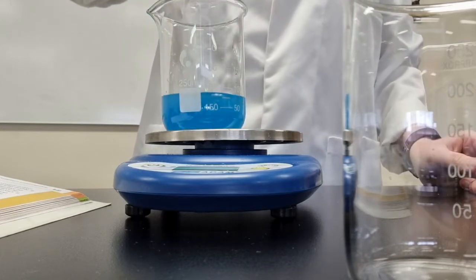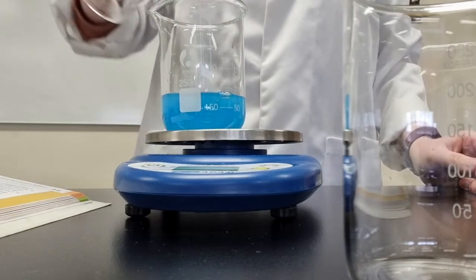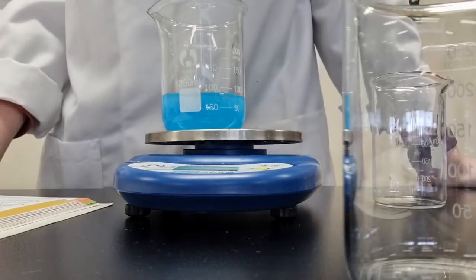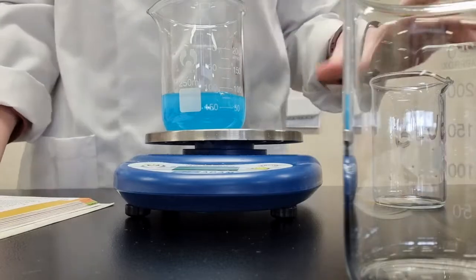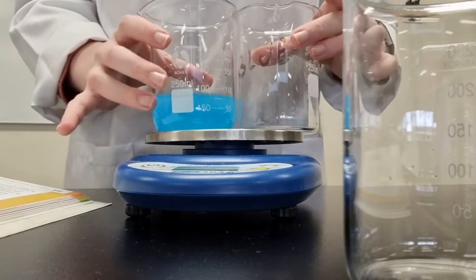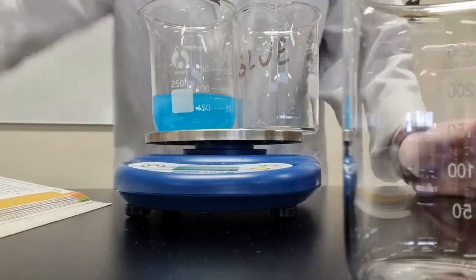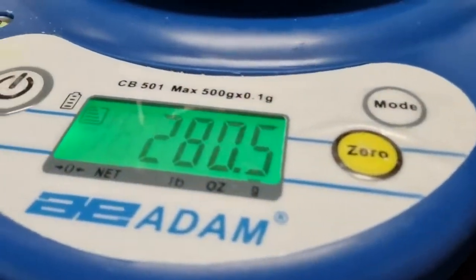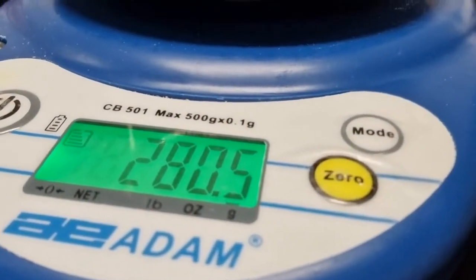Look at that. What we're going to do now is I'm going to put this beaker back on so we can weigh it. So still got 2 beakers, still got the same volume of solution, and we're going to check our balance. Hopefully you can see that.